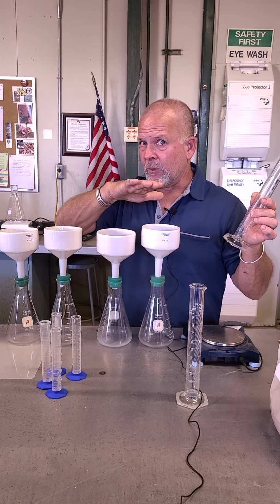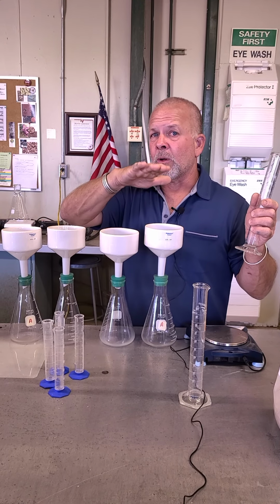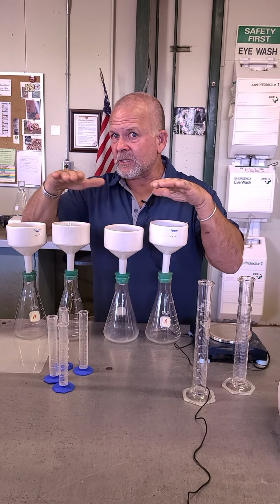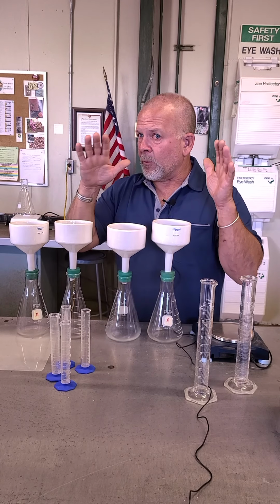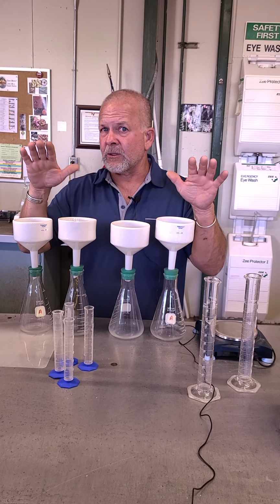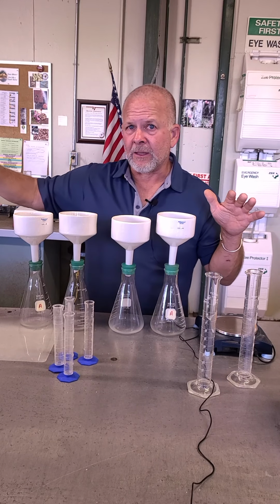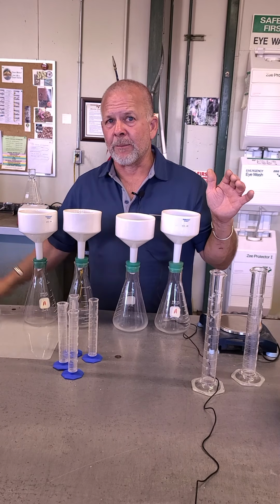So then after that, we're going to see what happens when we just maintain water on top of that. We're going to maintain just regular water on top of this after we've already put our treatments in here of different salt solutions. So that's going to have some effect on the soils. We don't know what it's going to do yet, or how the different textures will react to those different salt, calcium, and sodium solutions. But that's kind of what we're going to measure. But the first step is just to go ahead and apply the appropriate treatments to each one of our soil samples. So we'll go ahead and do that and come back.